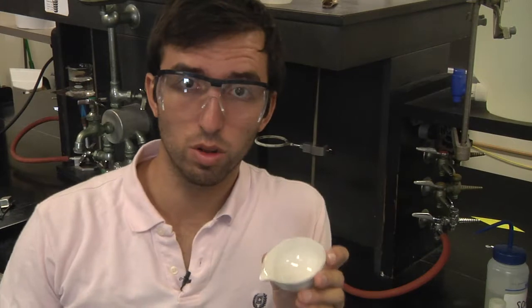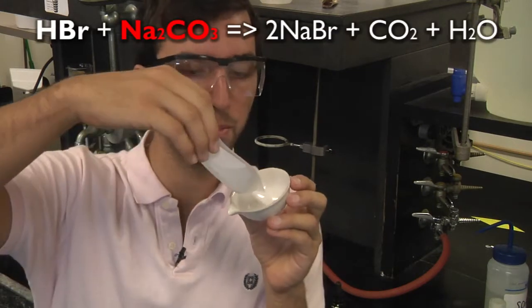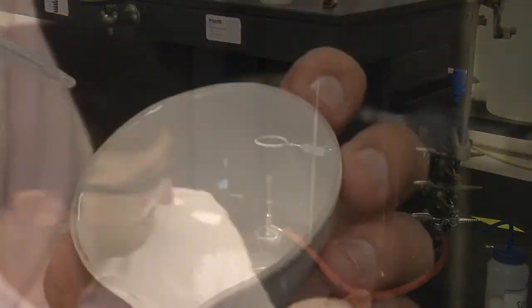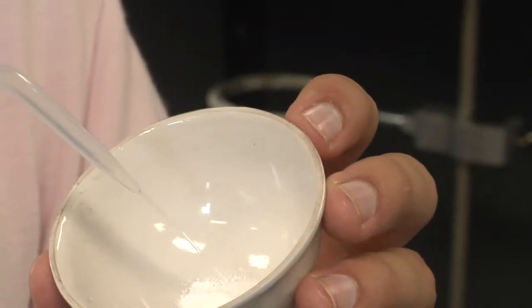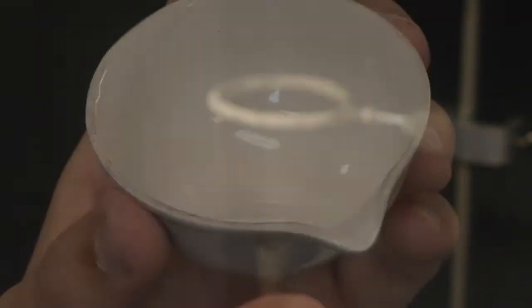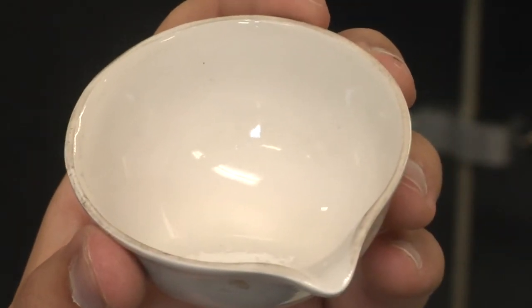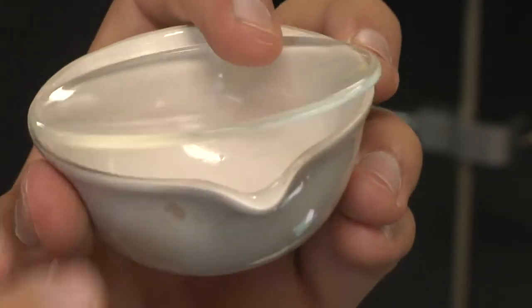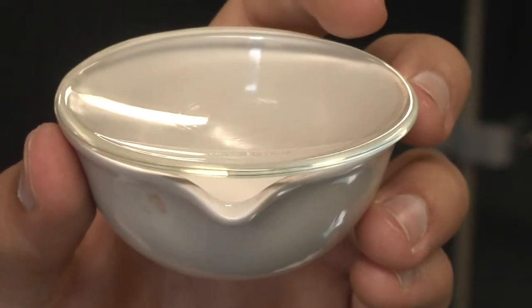To our dry casserole, we will add sodium carbonate — approximately one gram. Moisten the sodium carbonate with a little bit of water. Your mixture may begin to fizz, so cover it with a watch glass to avoid losing any substance. Can you hear it fizzing?